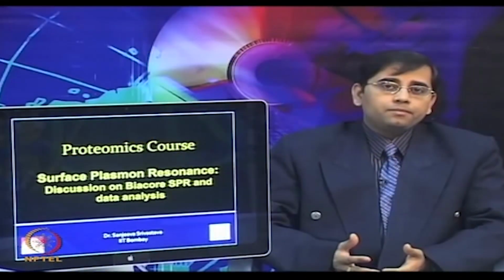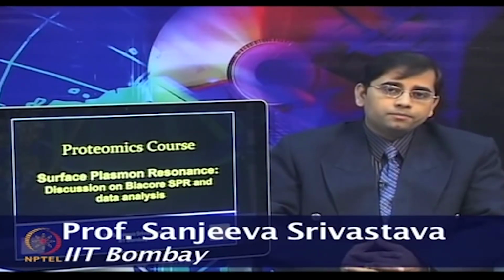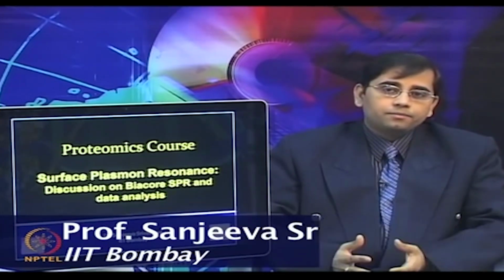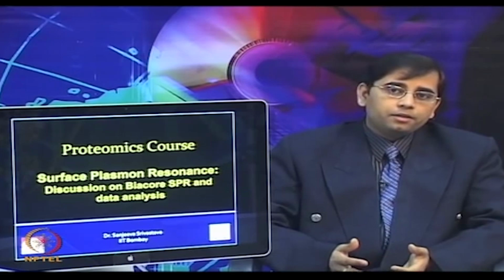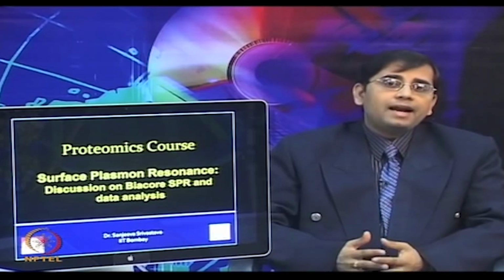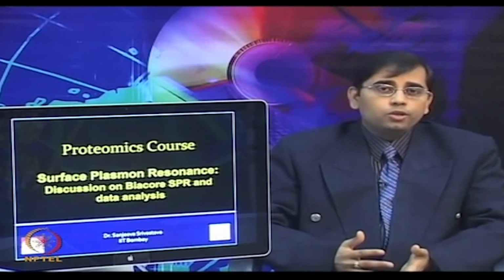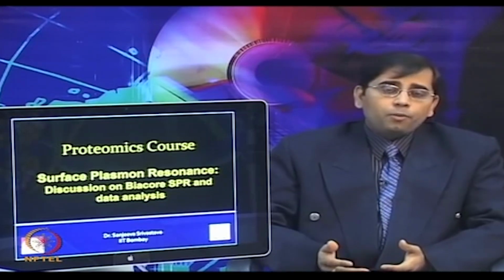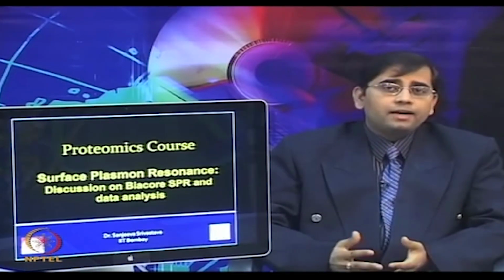Biological systems depend upon the molecular interactions of two or more biomolecules, so that they can form stable complexes. For biomolecular interactions, the principles of thermodynamics, biomolecular structure and recognition play a very crucial role. The identification of interacting protein partners of known function with those having an uncharacterized role, by performing these types of experiments, makes it possible to understand the biological process of uncharacterized proteins.